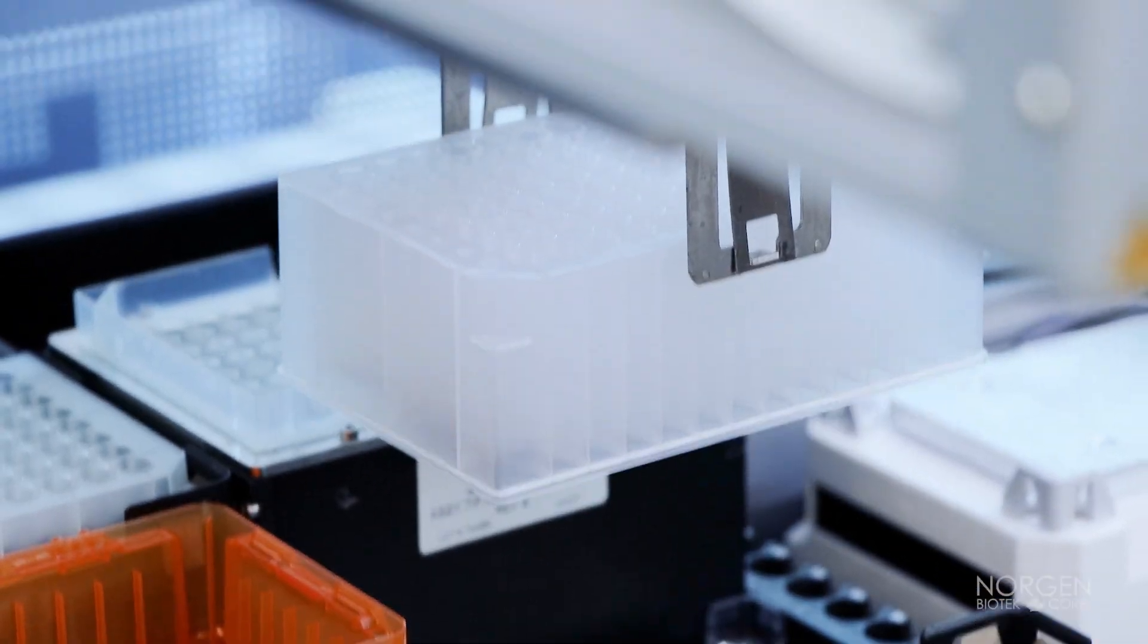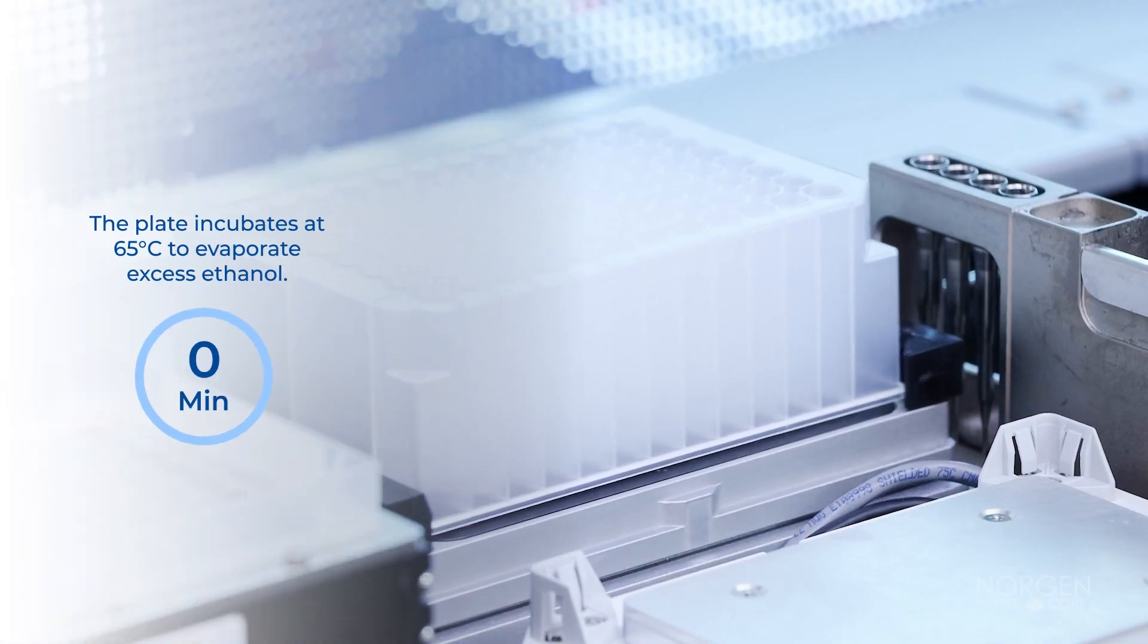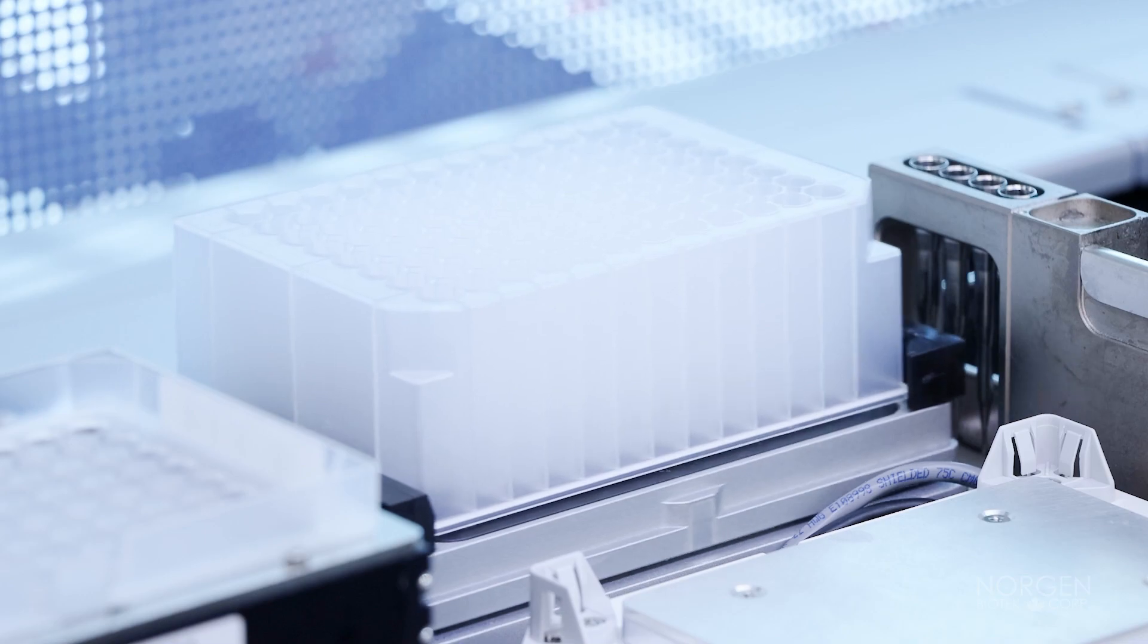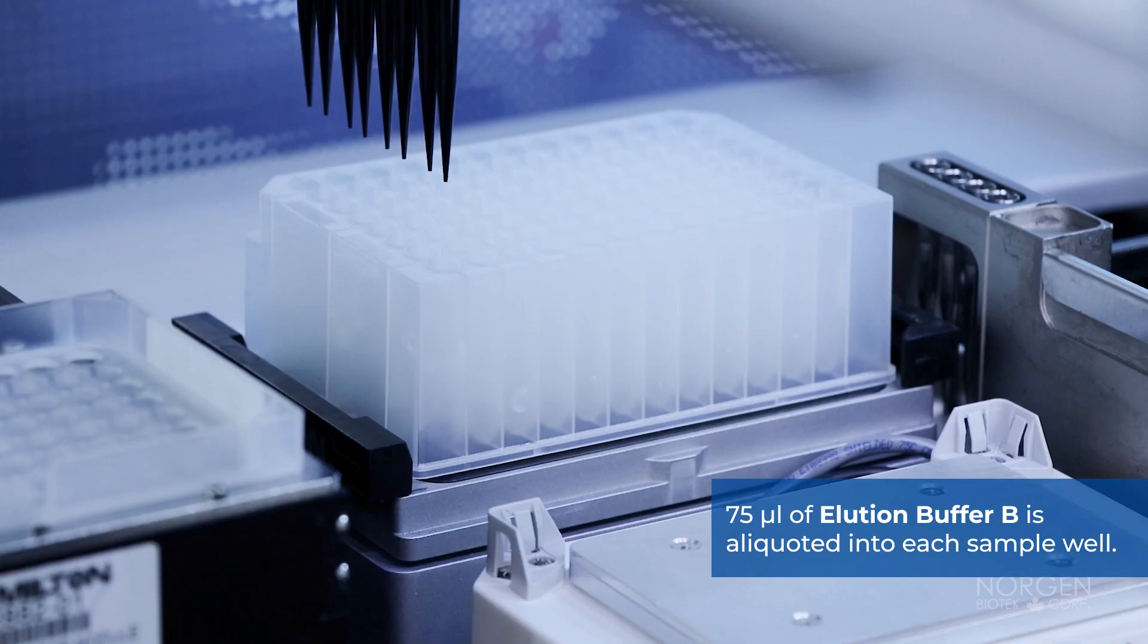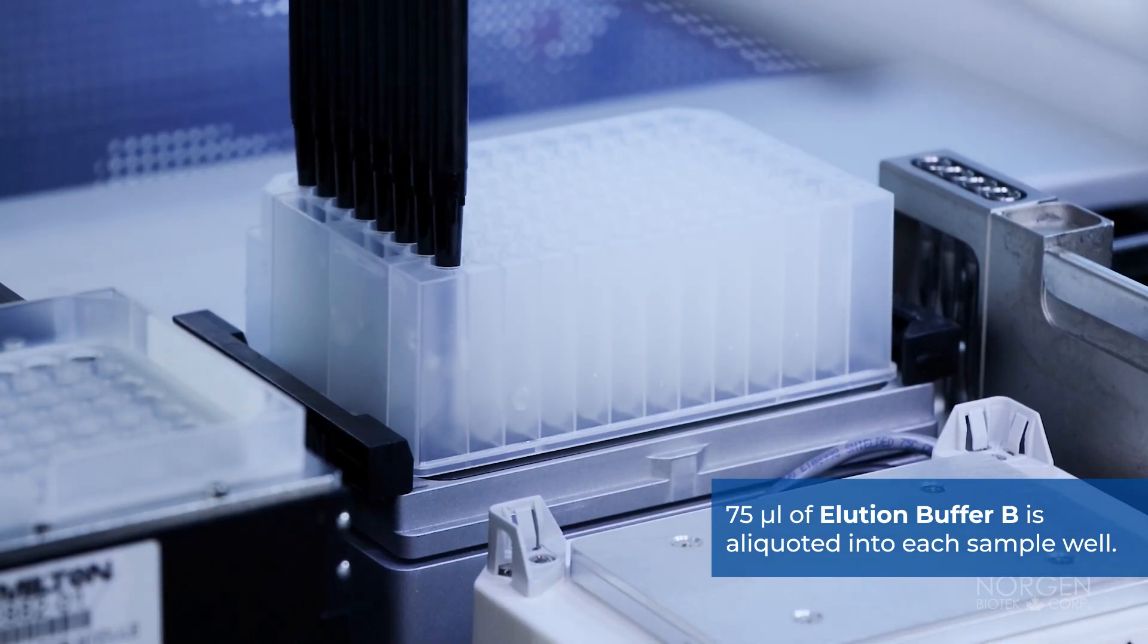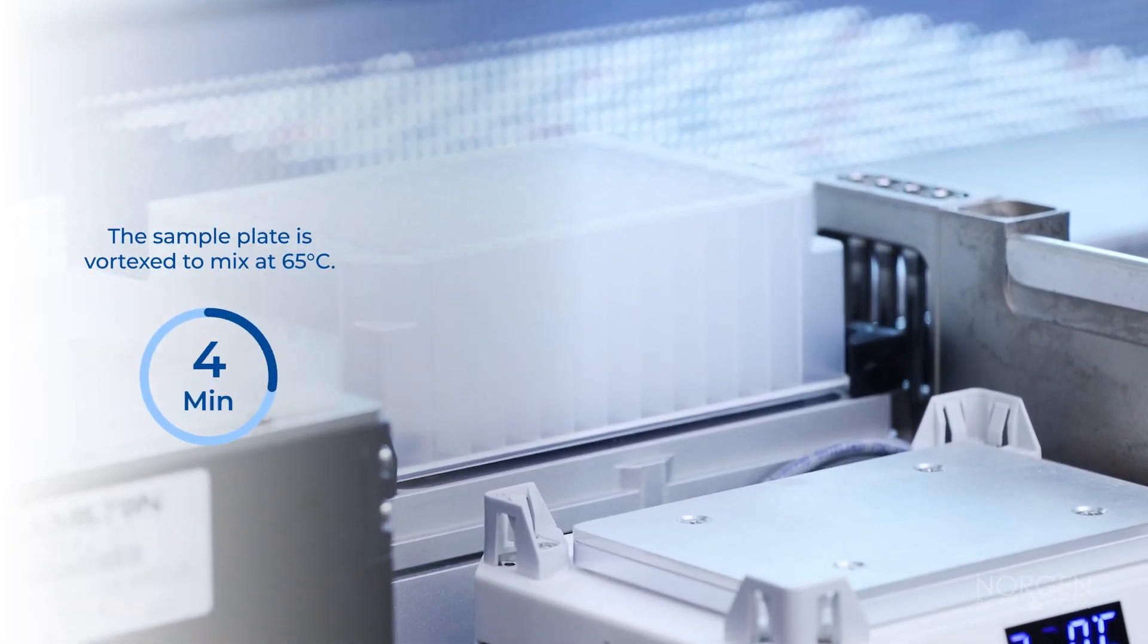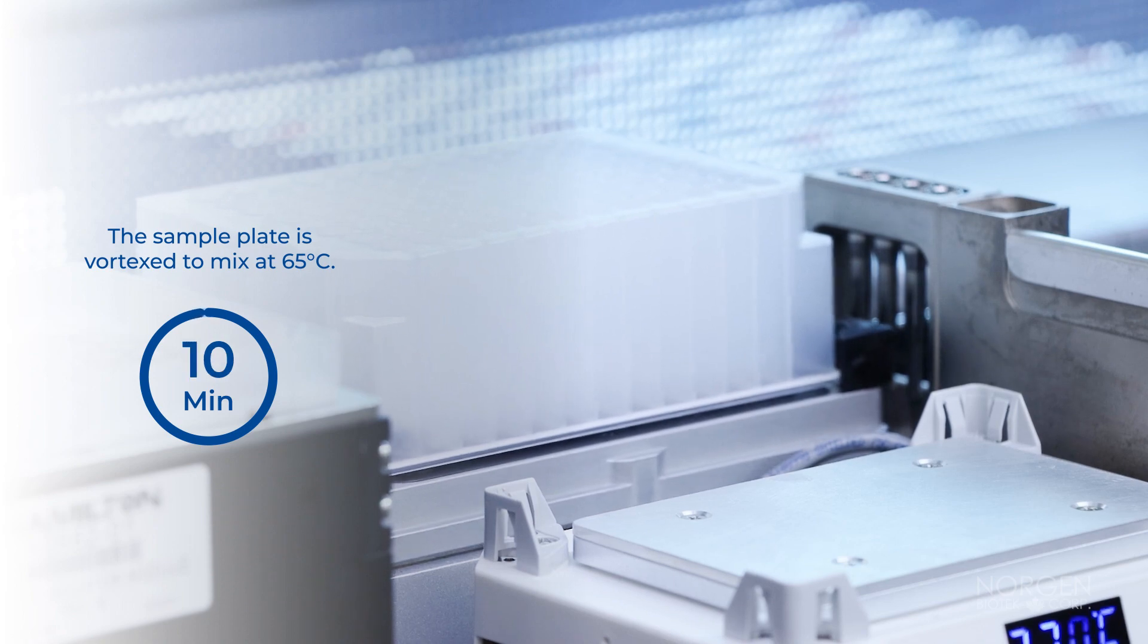The sample plate is transferred to the heater shaker and incubated at 65 degrees Celsius for 5 minutes to evaporate excess ethanol. After incubation, 75 microliters of elution buffer B is aliquoted into each sample well. The sample plate is then vortexed to mix at 65 degrees Celsius for 10 minutes.